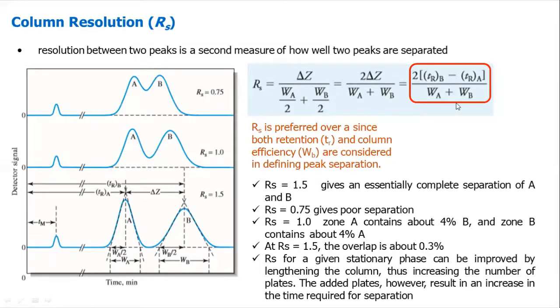Rs can be calculated using this equation.